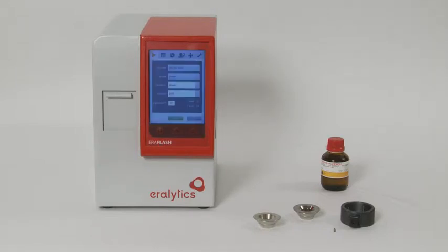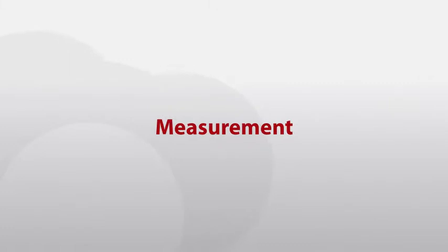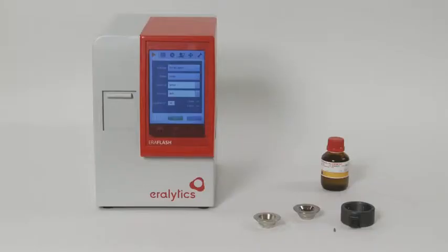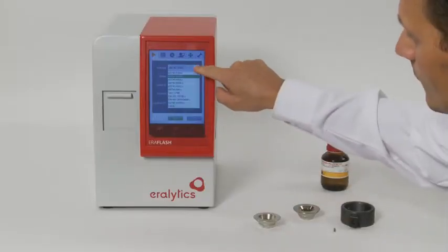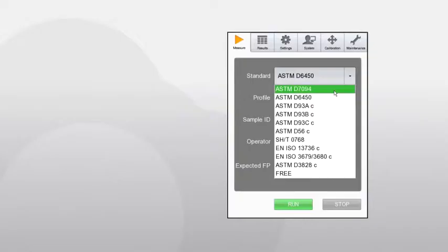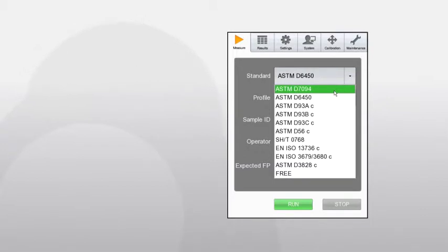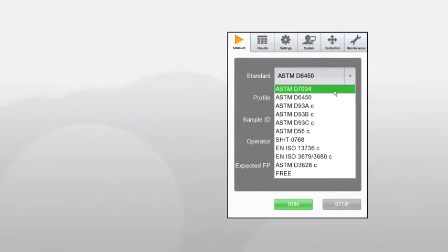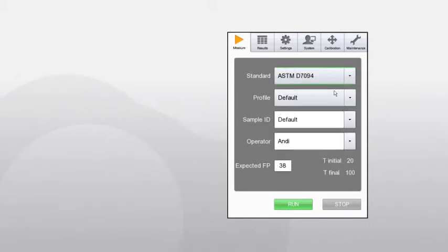Switch on the analyzer by pushing the power button on the front. After a few seconds, the instrument is ready for use. Measurement: Select one of the standard methods listed in the first drop-down list. Eralytics Flash strictly follows the latest ASTM flashpoint methods ASTM D6450 and ASTM D7094. Additionally, the analyzer offers several pre-programmed correlation methods to provide results in excellent correlation with traditional closed cup methods such as ASTM D56 TAG and ASTM D93 Pensky-Martens, as well as with flash/no-flash methods.